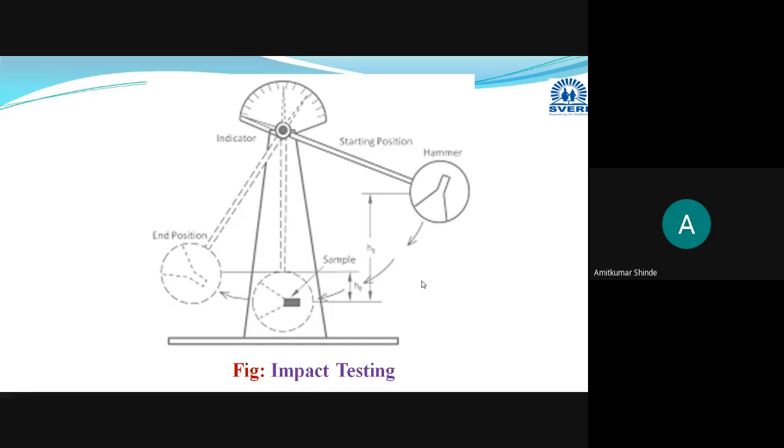It is the energy absorbed by that particular material or test specimen. Impact is also there, and as the specimen is fixed in the form of a cantilever beam, at the free end, due to the impact from the hammer, tension is also created. That's why the amount of energy absorbed by that test specimen before the failure is termed as tensile impact energy.